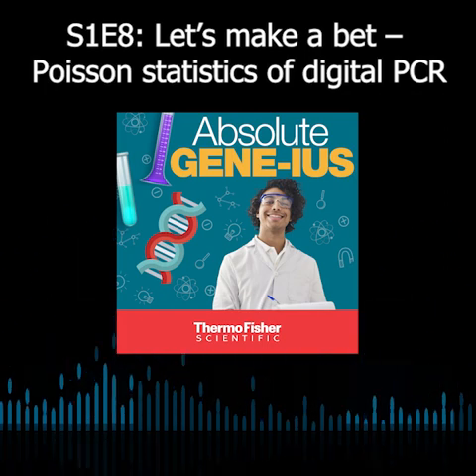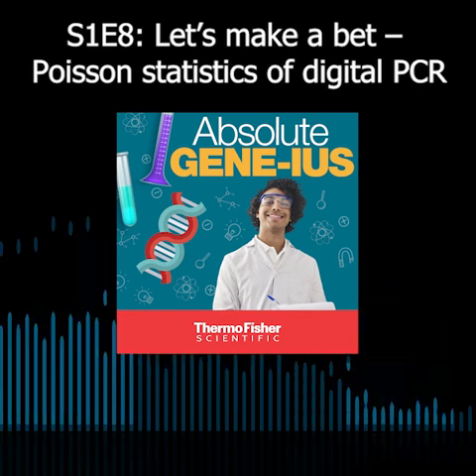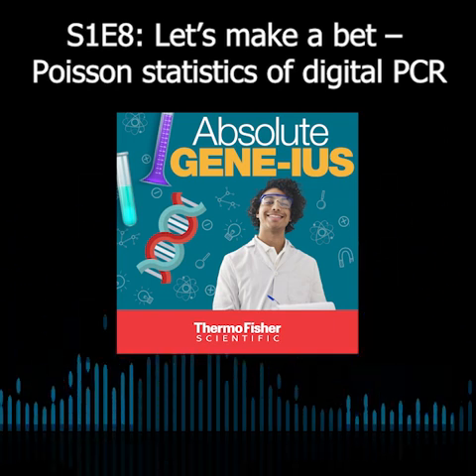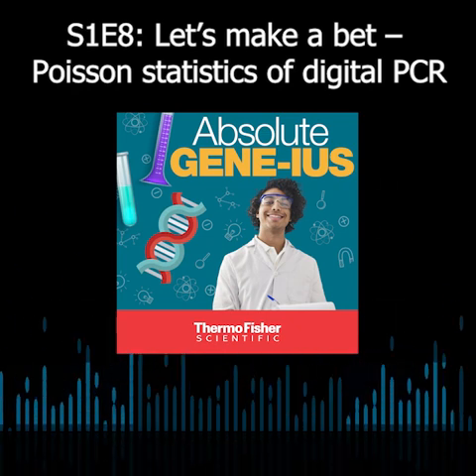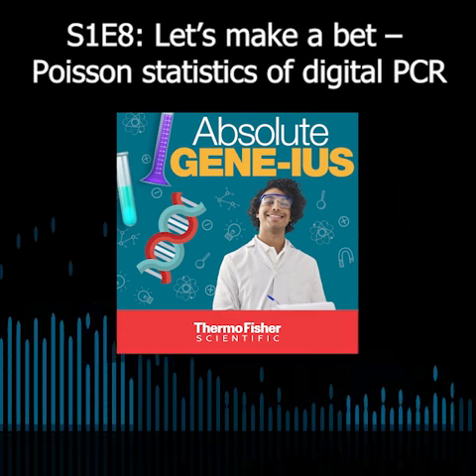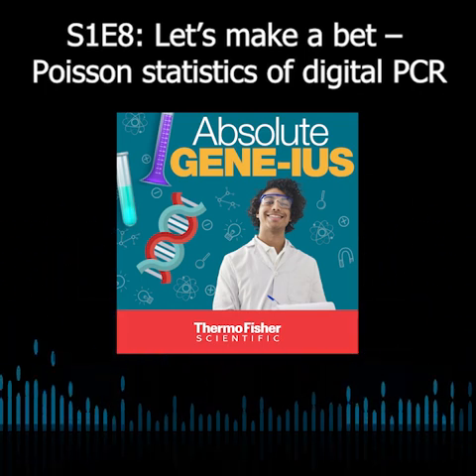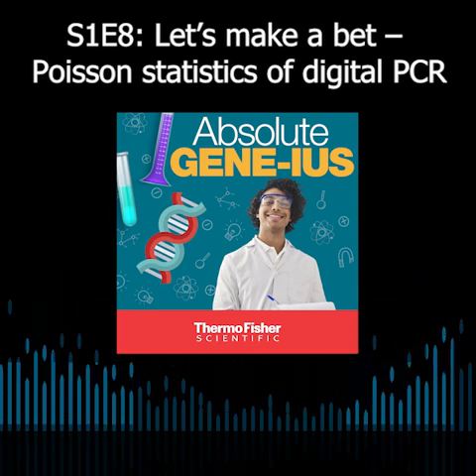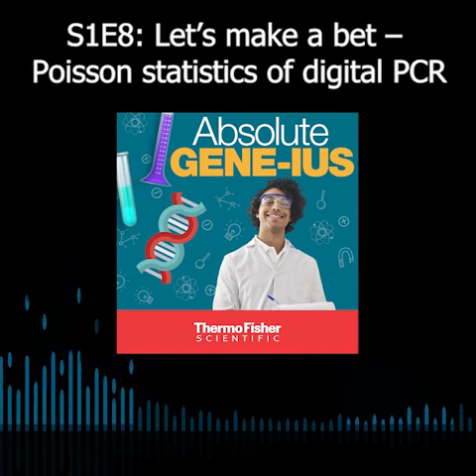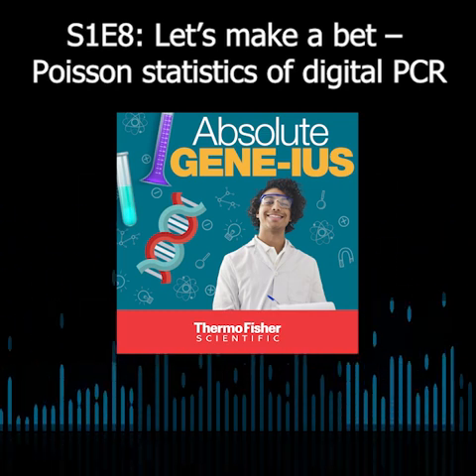So all of that to say, the same thing exists in digital PCR. Despite having 20,000 microchambers, like our MAP16 plates do, it only takes a really small number of DNA molecules to be present before we have DNA molecules sharing chambers, or like people sharing birthdays. The number of DNA molecules, I don't have the exact calculation, but it's on the order of just 1% of that 20,000. So not a lot. And for that reason, we can't assume that each chamber has just one molecule, because there's a tiny range of concentration where that might be safe to assume, but it quickly goes away because of how many combinations and ways those molecules can sit in the chambers.